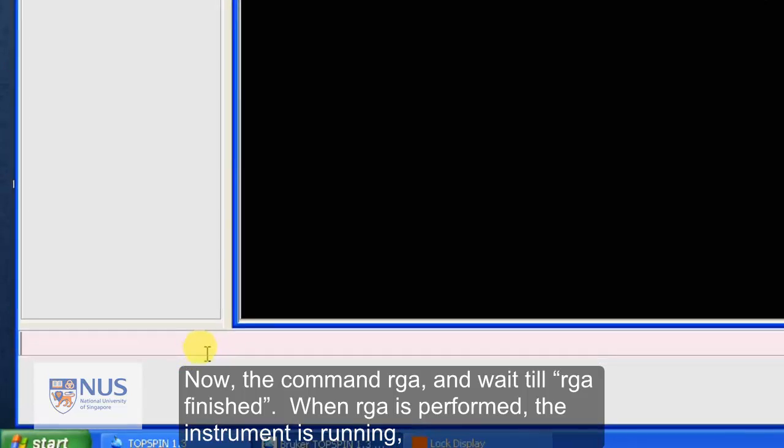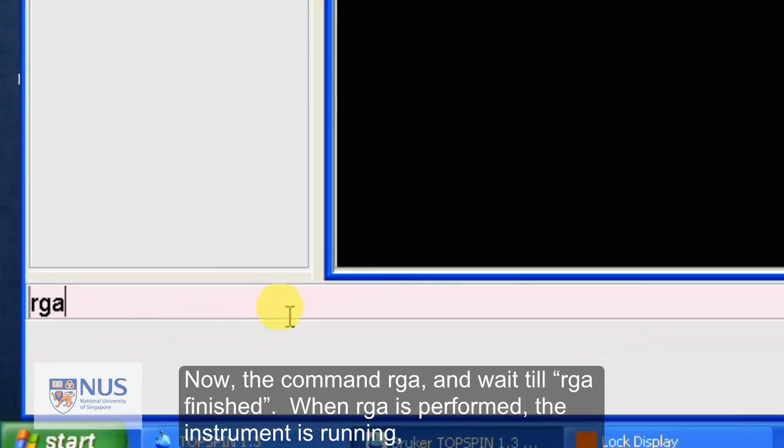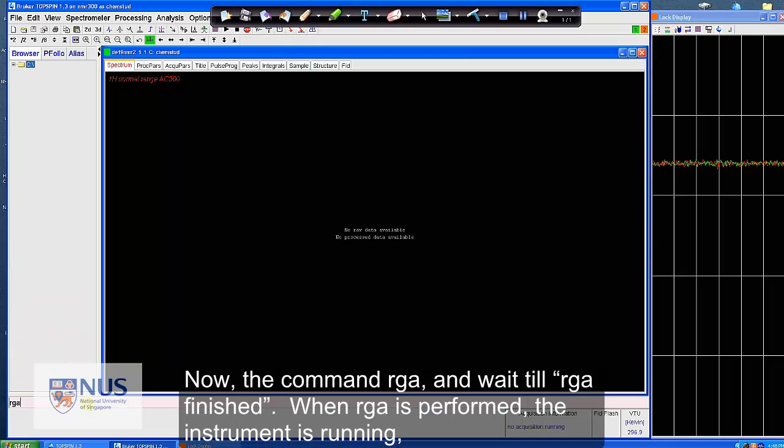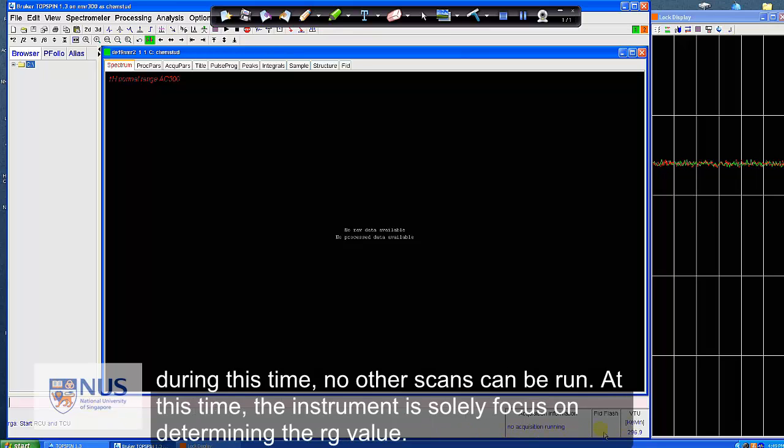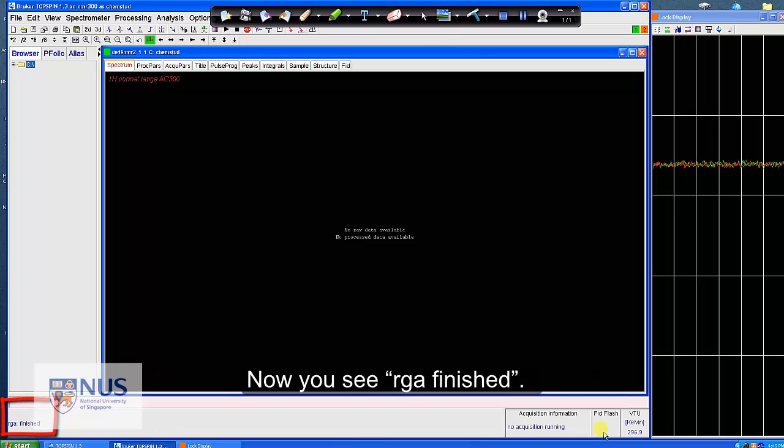Now, the command RGA. Enter. And wait till RGA finished. When RGA is performed, the instrument is running, and during this time, no other scans can be run. At this time, the instrument is solely focused on determining the RG value. Now, you see RGA finished.